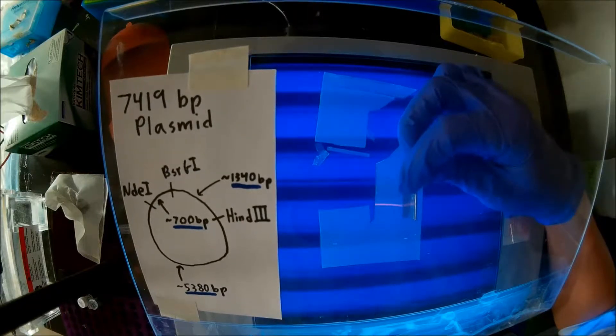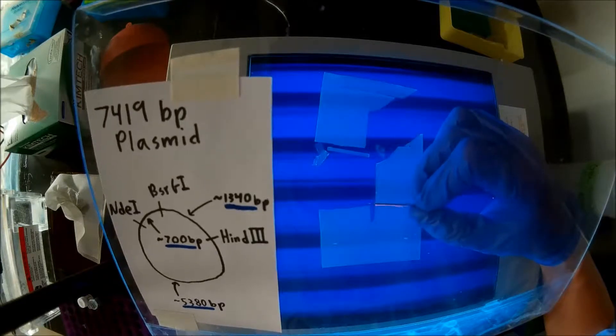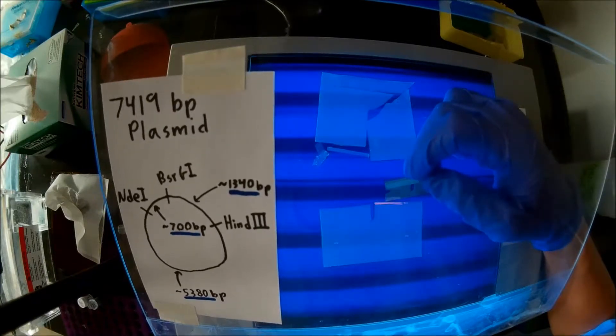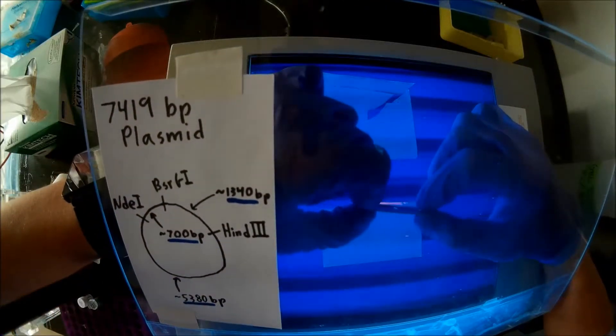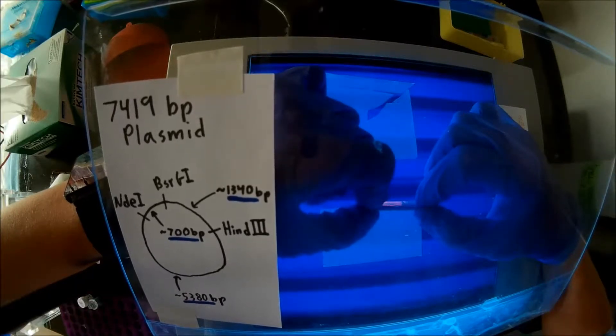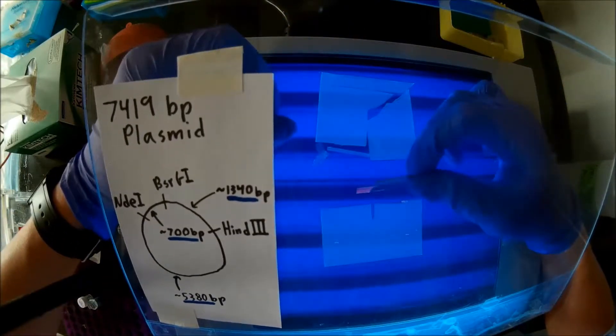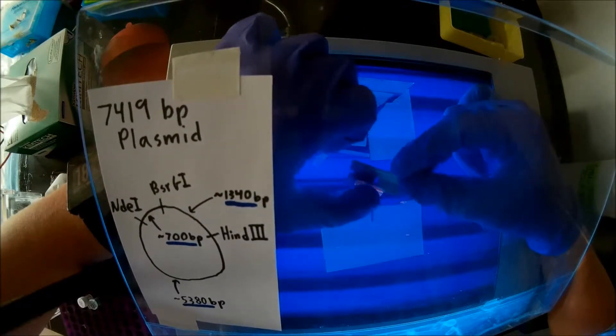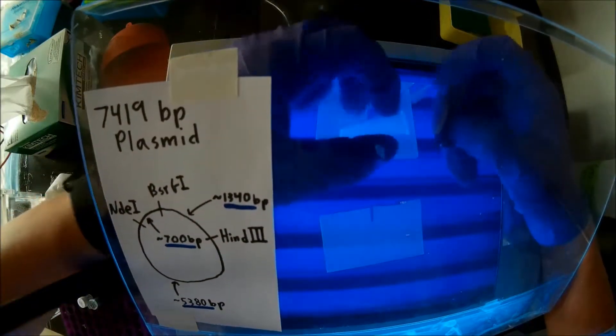And I'm going to do the same thing. I'm going to make sure that I'm cutting as close to the band as possible. Of course, this one's a little bit curved, so it makes that slightly more difficult, but that's alright. Try to get rid of that, whatever that frizzy thing is there. And I'm just going to cut at a slight angle. Excellent. So, there's my DNA sample. Again, it's fluorescent through the width of the gel slab, so I don't have to cut any of that off. And I'm just going to scoot that one into my next centrifuge tube.